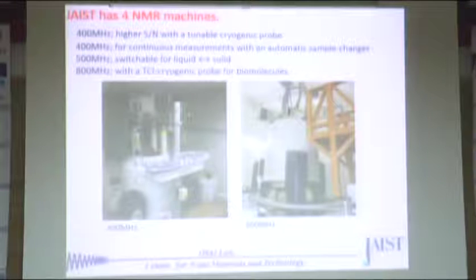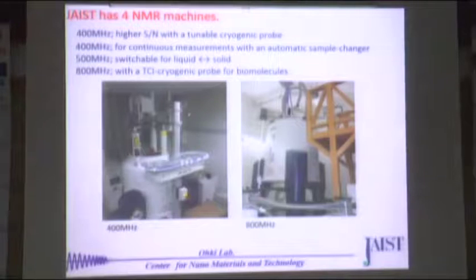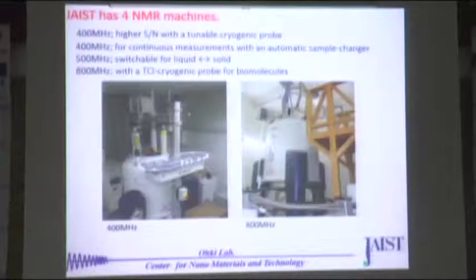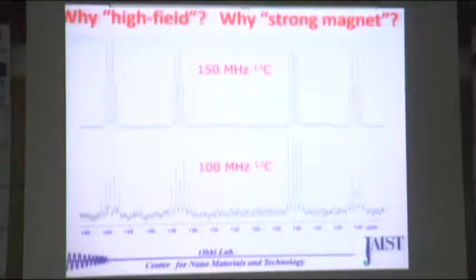The superconducting magnet is cooled by liquid helium and liquid nitrogen. So why do we need such a big magnet? Why do we need a strong magnet?